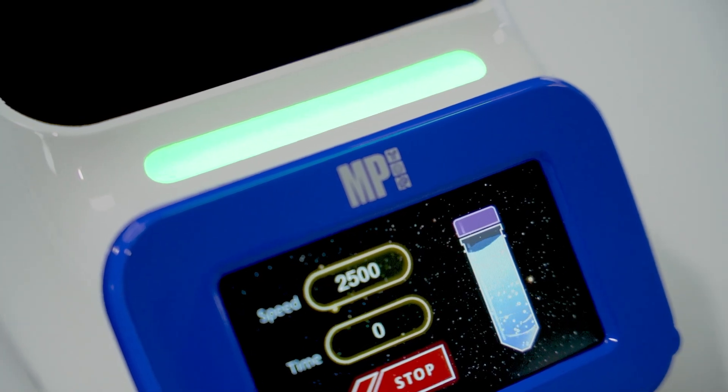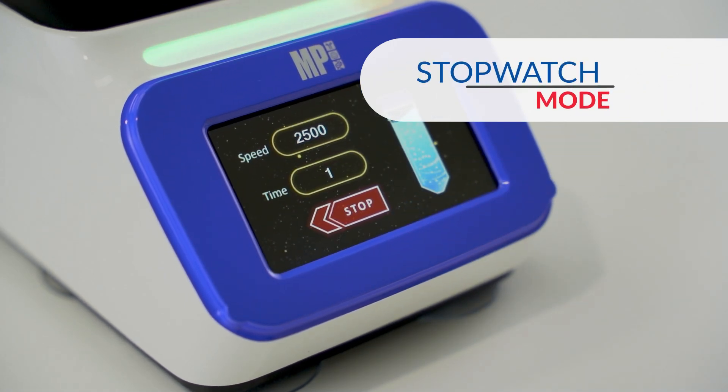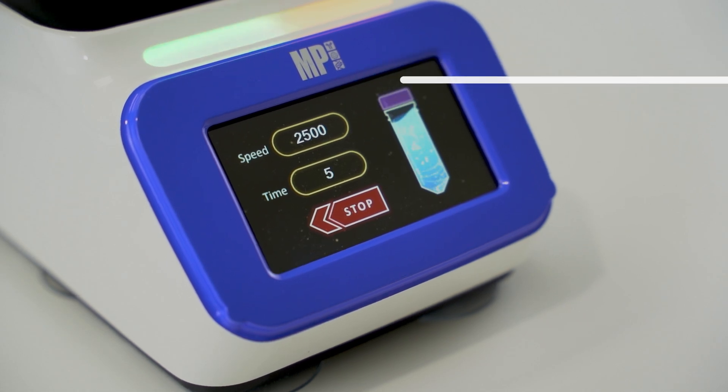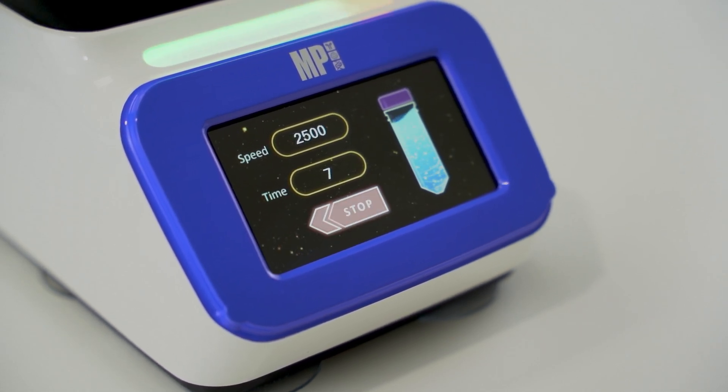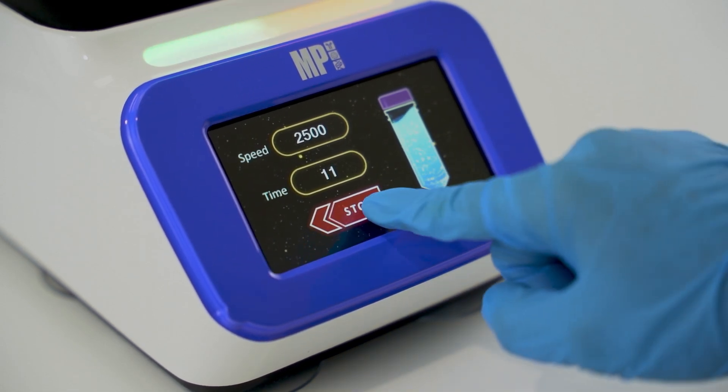If the time duration is not set and remained at zero when the operation starts, the Vortanizer will enter a stopwatch mode. The vortex operation will keep running until the user presses the stop button. The stopwatch time reflects the elapsed time of the operation.